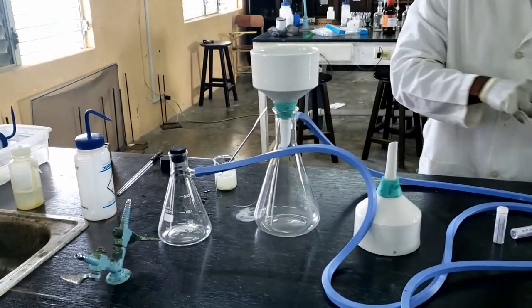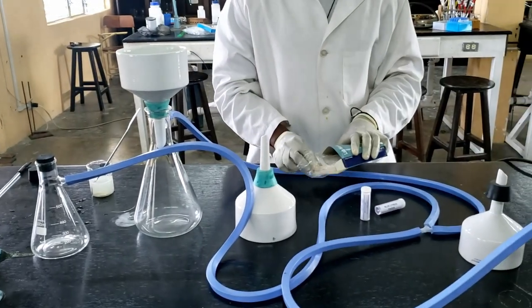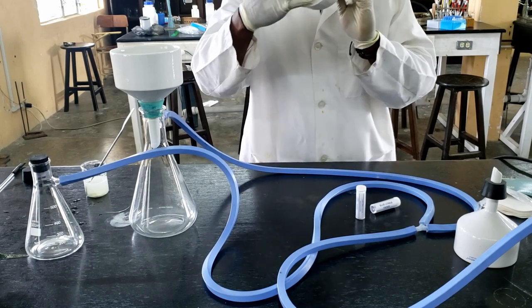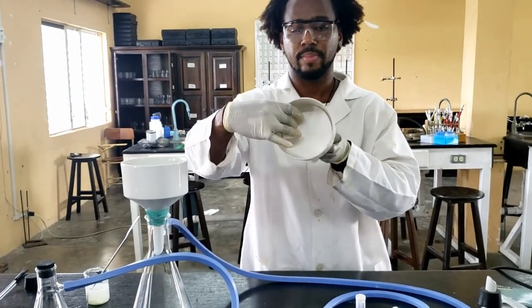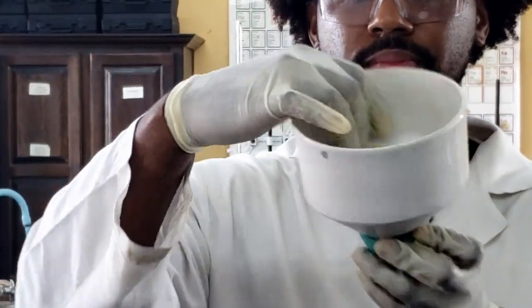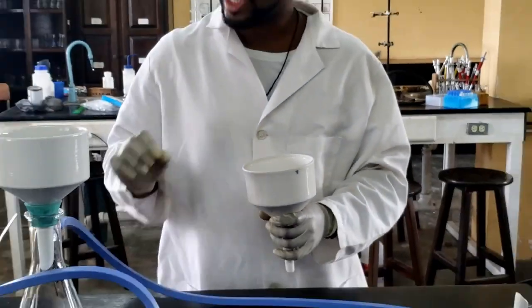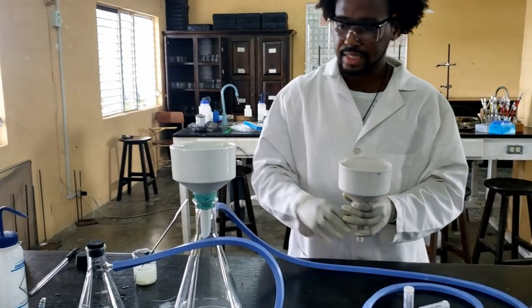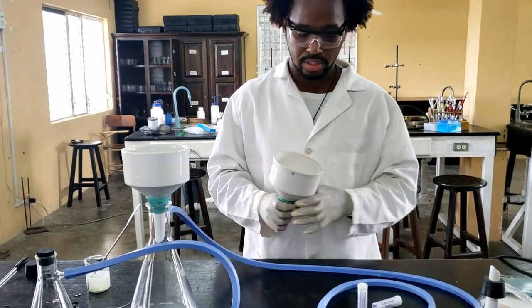We get a piece of filter paper. These come pretty much standard size to fit in the Buchner funnel. When you place the filter paper inside the Buchner funnel, you want to make sure the filter paper covers all of those little perforated holes. That way when you filter, the solids don't pass through, but the liquid passes into the vacuum flask, and then you can dry the solids and collect those in the end.